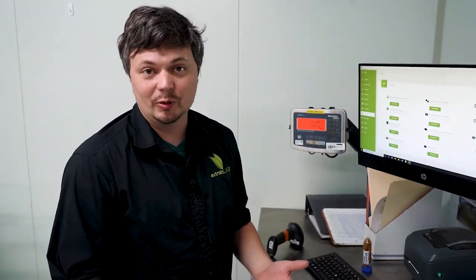Hi, I'm Cole Holstrom and I will be walking you through just a brief overview of the IGW Lab system. We'll talk about its basic functionality and I'll show you a few of the cool bells and whistles.